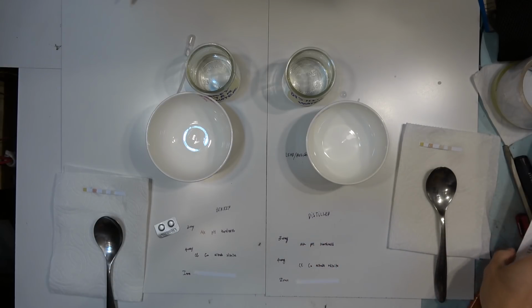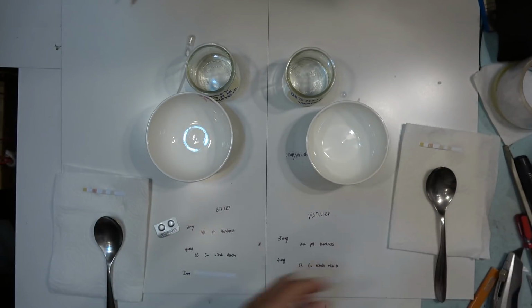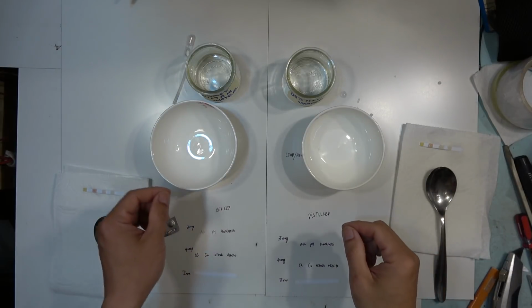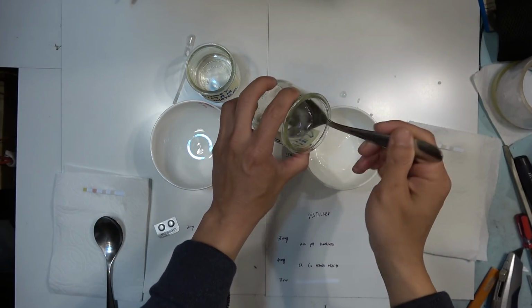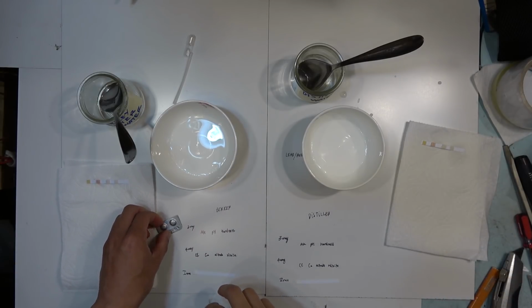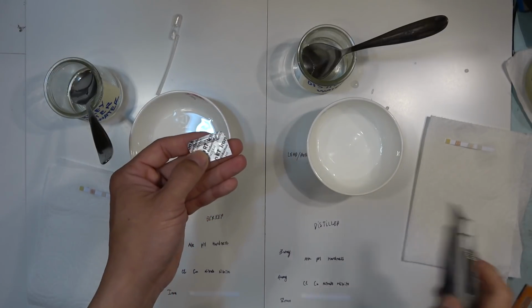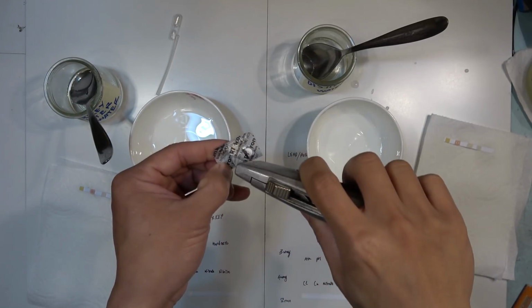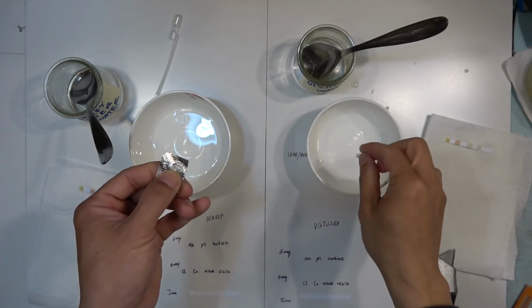My last test in this kit is the iron test. And I have cleaned out the bowl. So every test I have to clean out the bowl and dry it before I put in more water sample. Put in the new sample in the bowl for testing. Right. So for the iron test, we got the pills and we got the strip. First you're going to have to remove the tablet and then dissolve it in the water before you put the strip in.